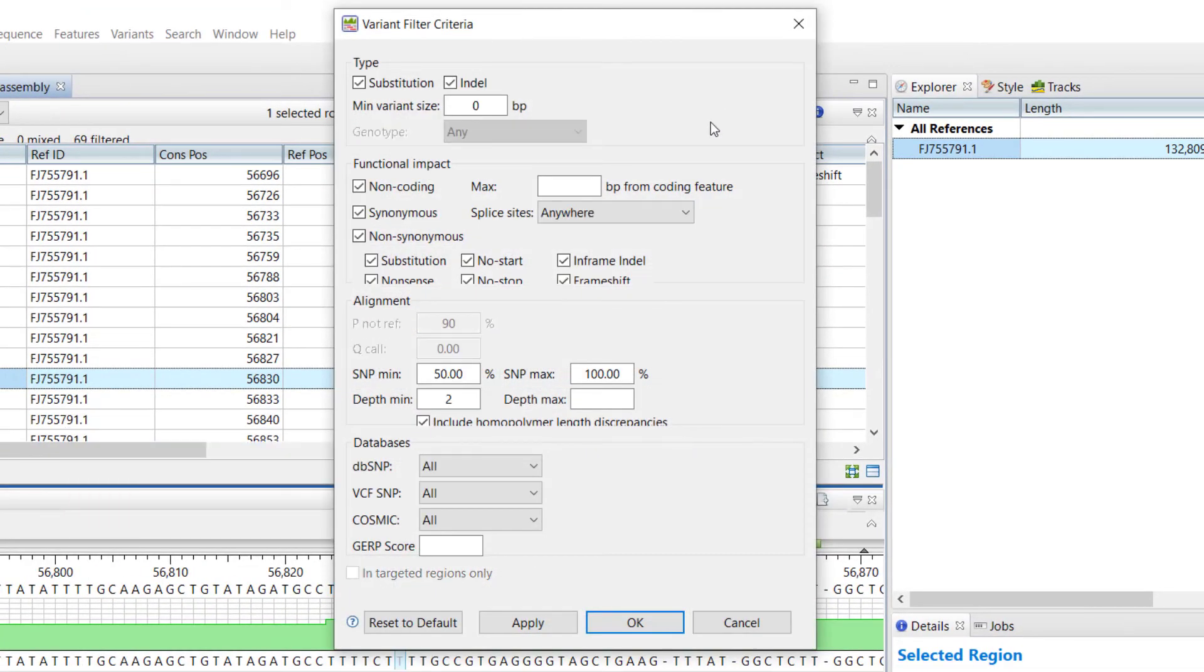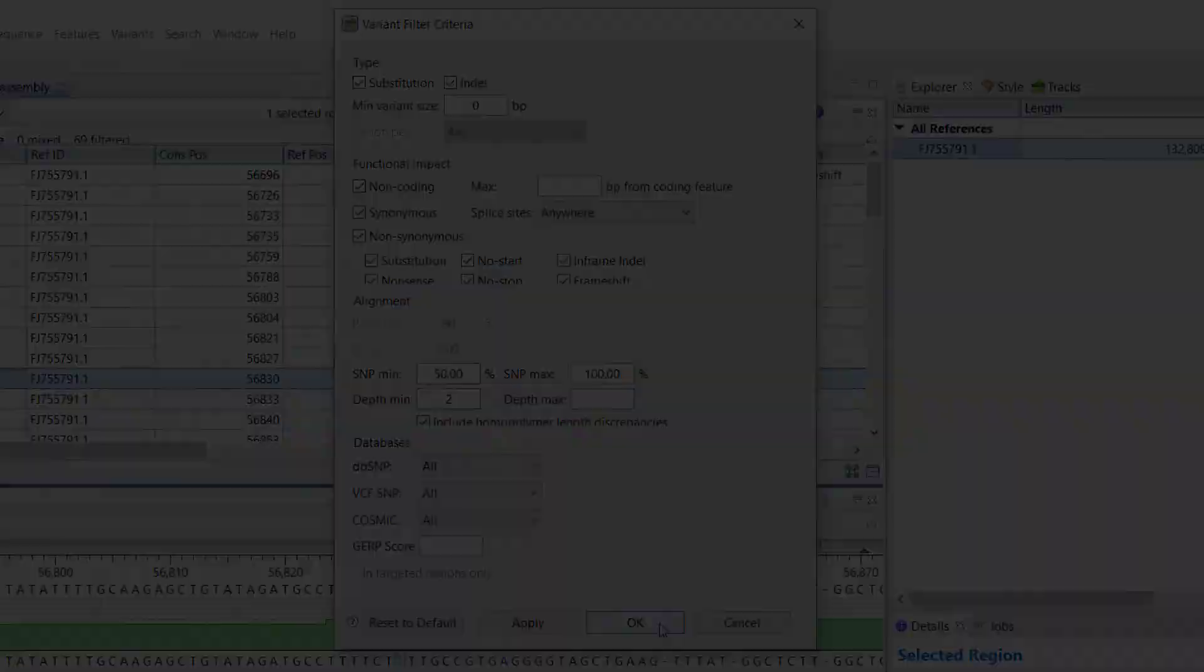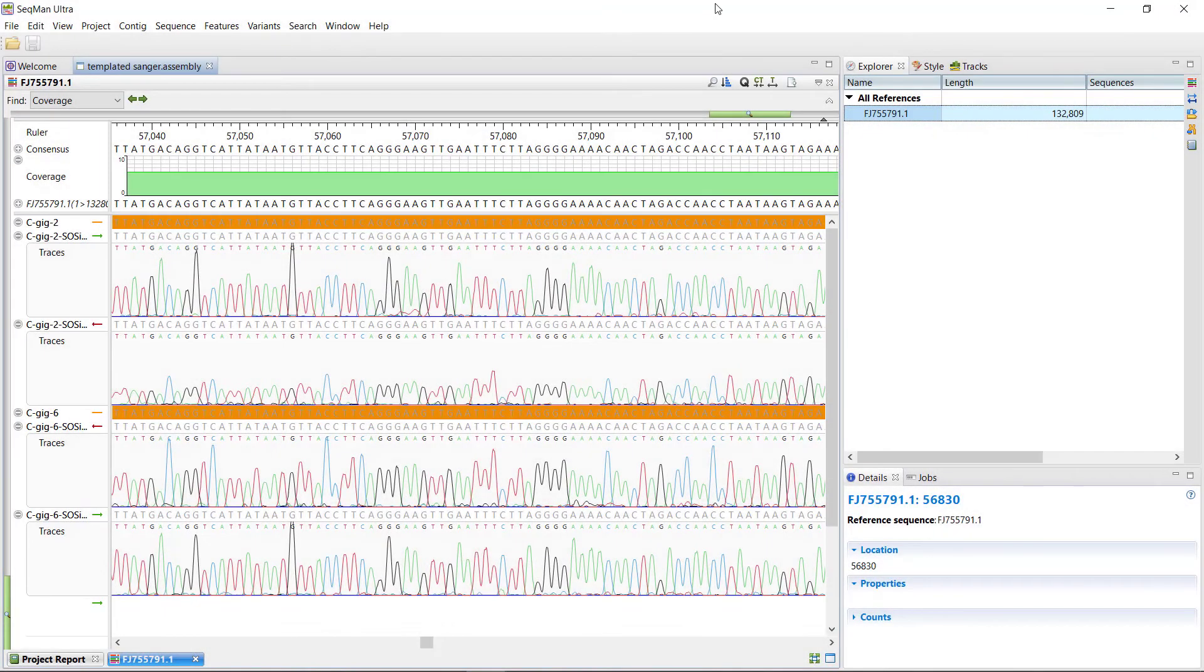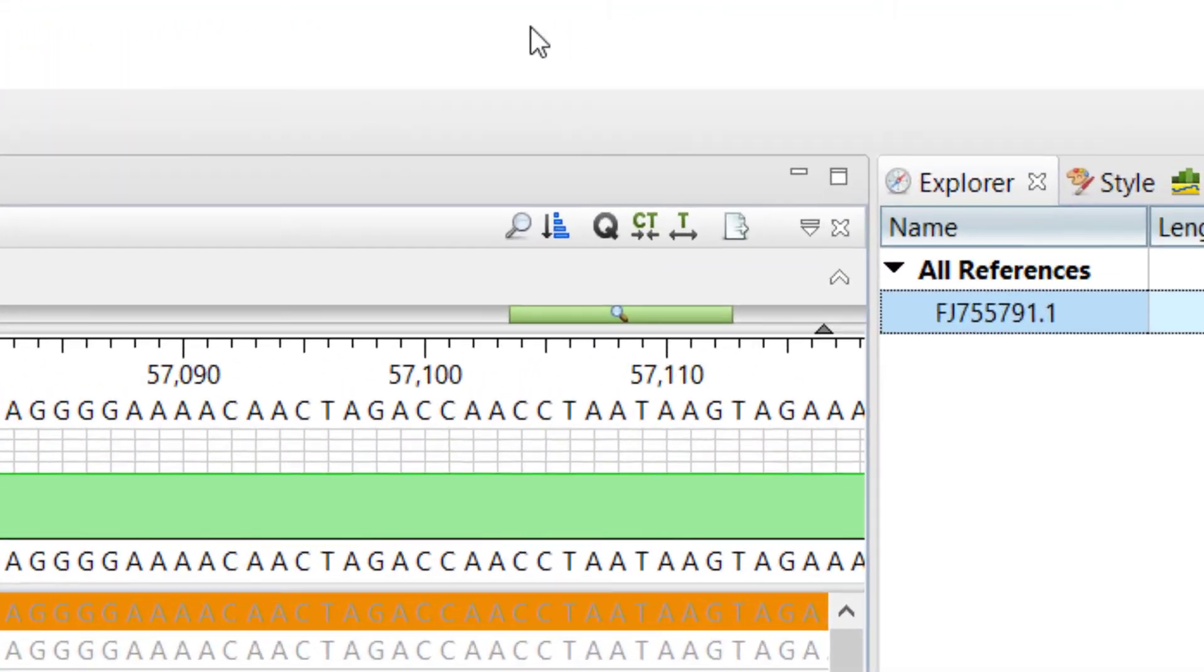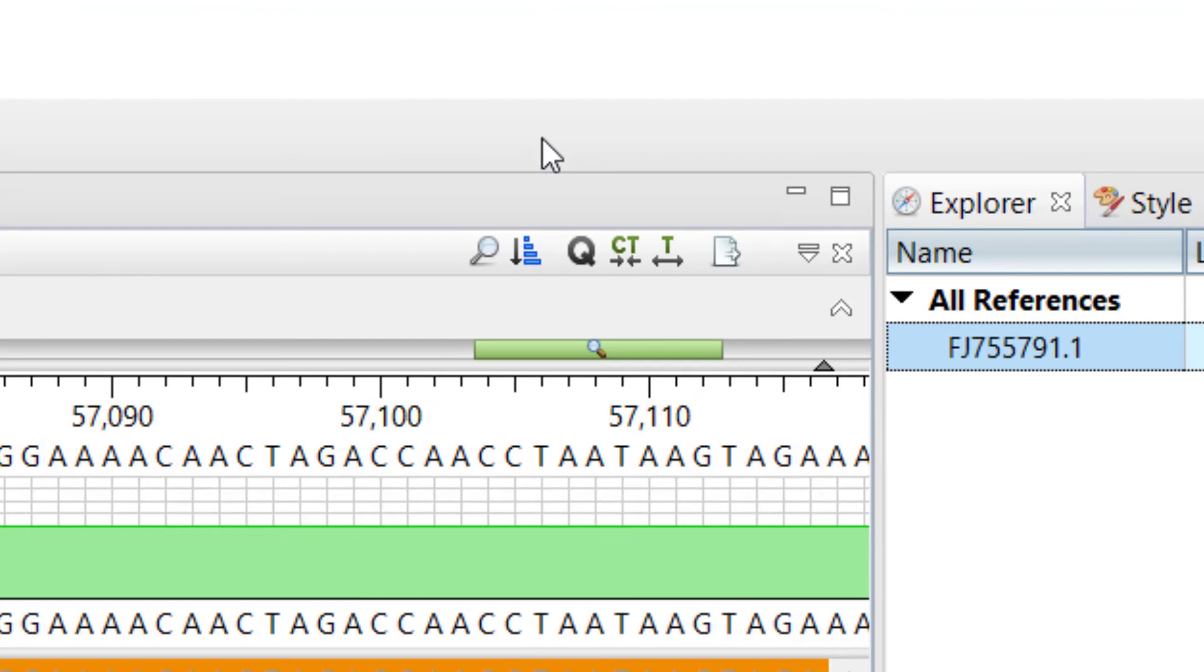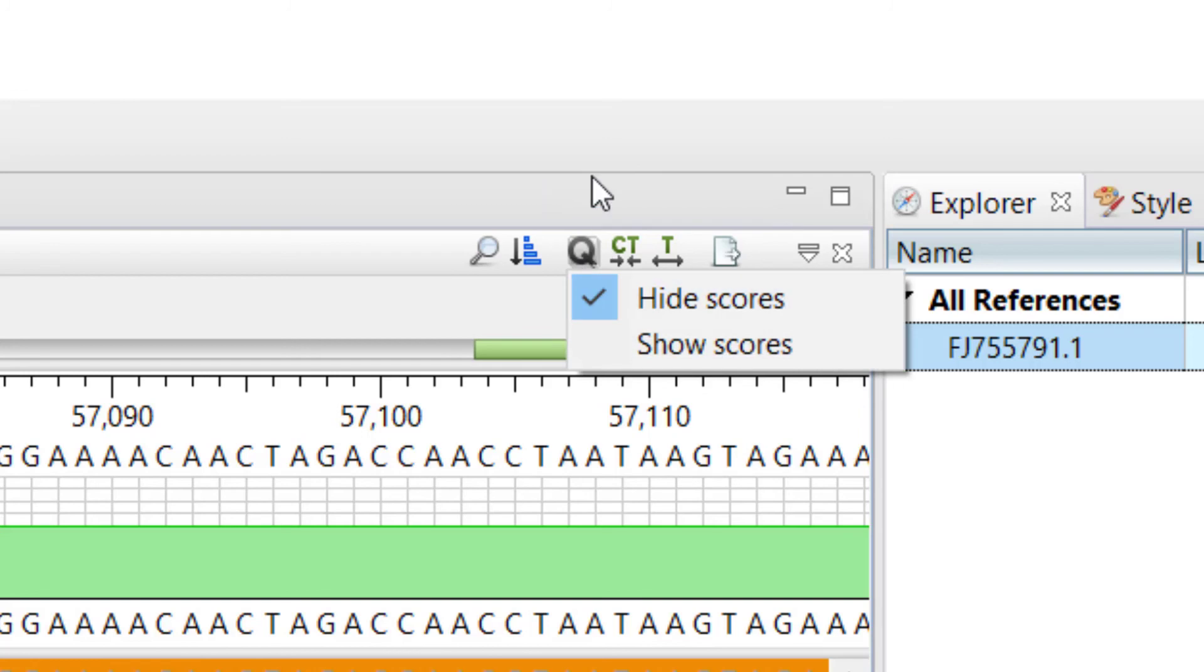For this example, I am going to leave the filters at their defaults. You can validate SNPs by looking at trace data and quality scores. To show quality scores, select the Quality Scores tool on the alignment toolbar, then click Show Scores.